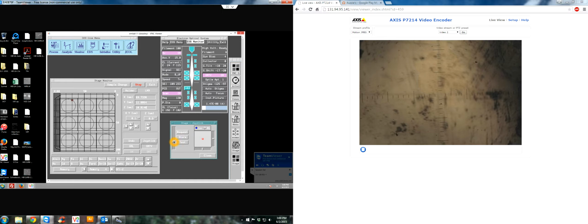So the reason why I chose benitoite, because of this fluorescence phenomenon, I can actually show you where the beam is located. Okay, so if we turn the scan generator off, you'll see this fluorescent circle on the surface of the sample. This right here is the location of the beam. Now this can be helpful in some ways. This is exactly where the beam is striking the sample.